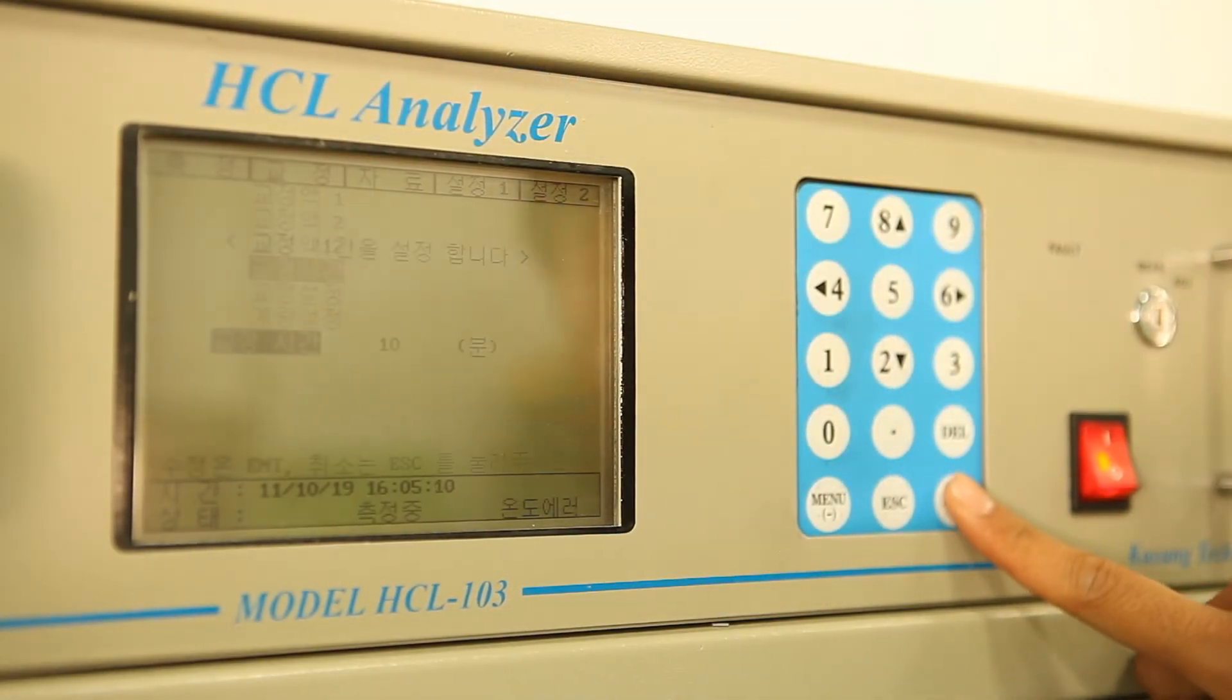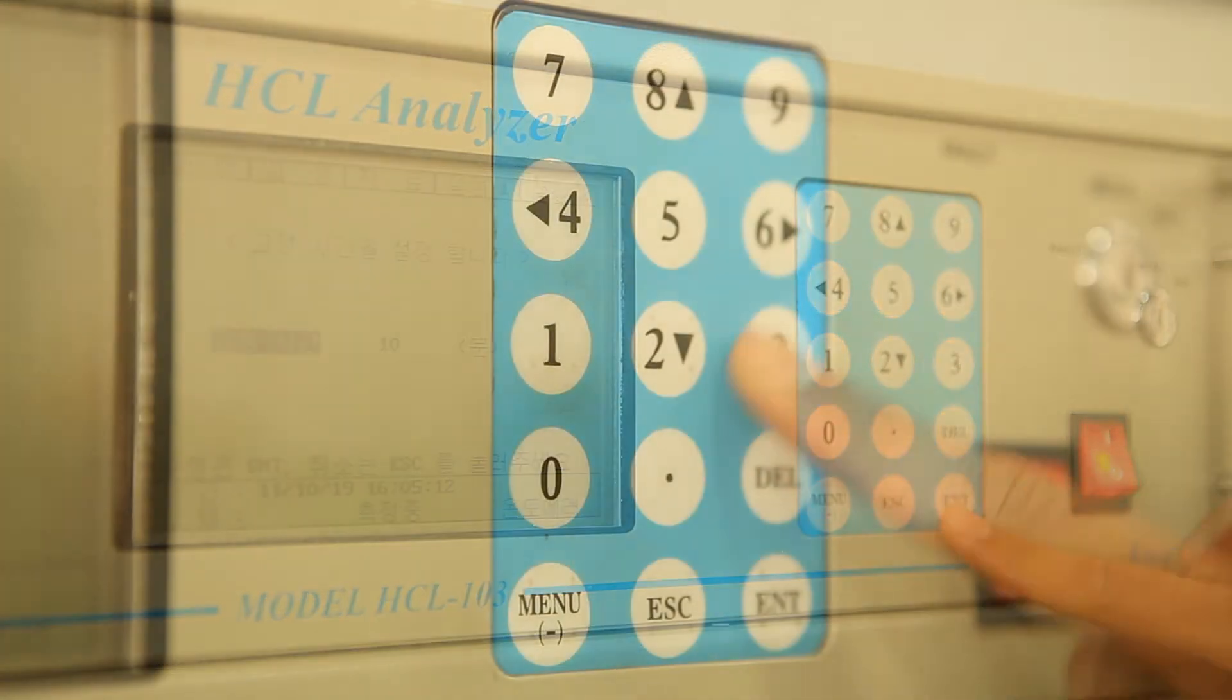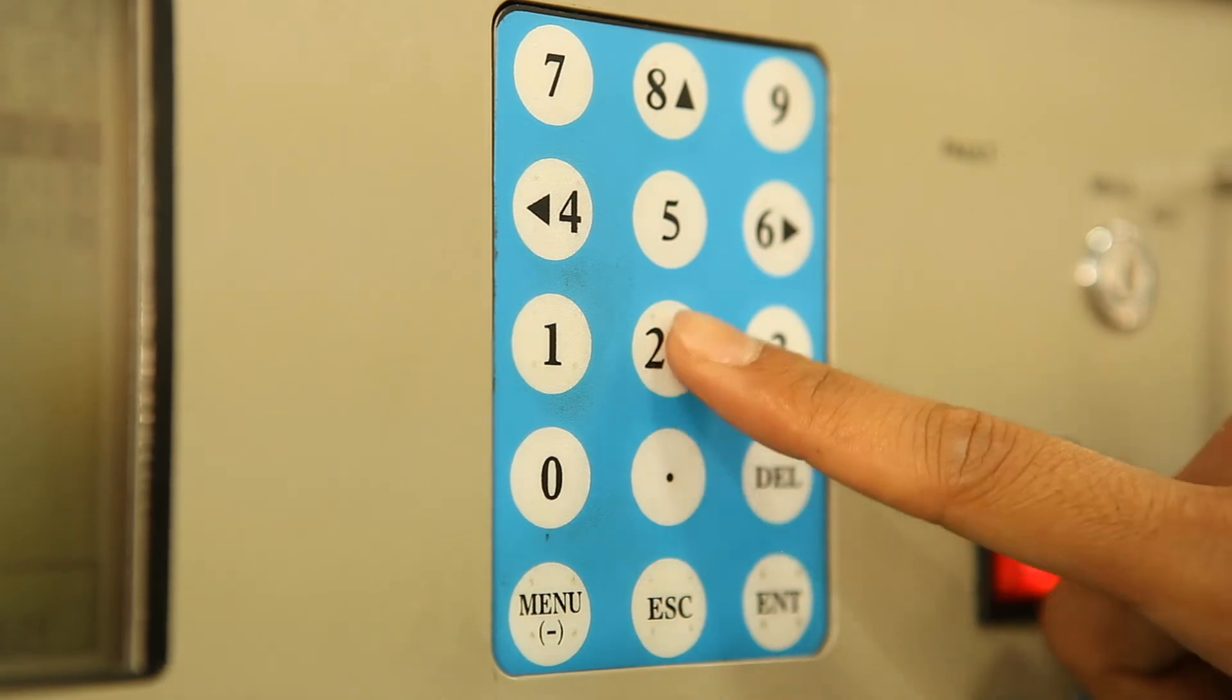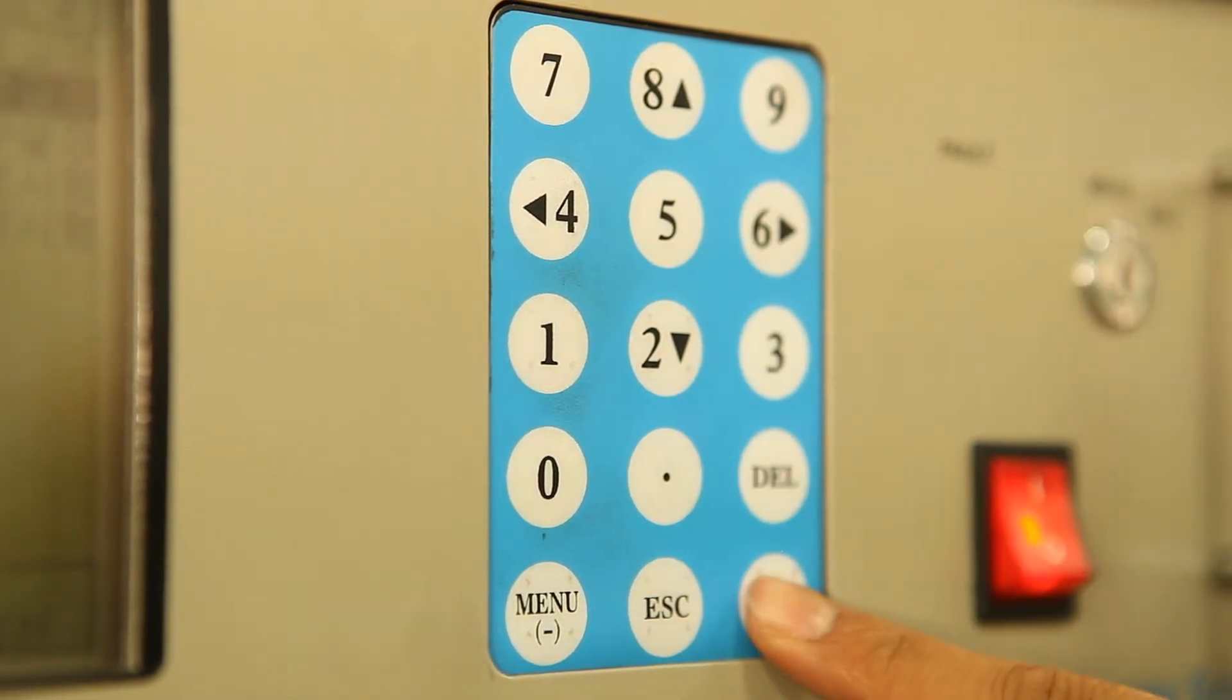Data is highly reliable because sensibility can be checked every day through the automatic sensitivity check and auto-calibration mechanism.